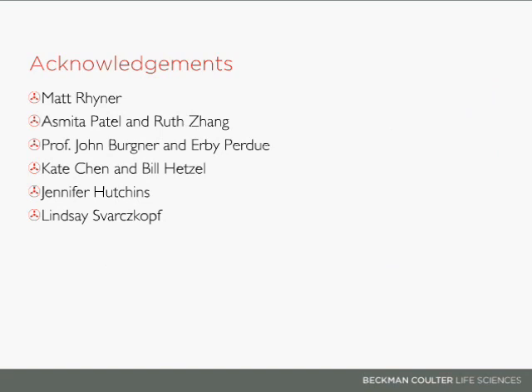So I've had a chance to run through the survey. At this point, I'll address several of the questions that were asked. First one here is, how can I know the shape of the nanoparticles by AUC? This comes out actually from the fitting in one of the third-party software programs, SedFit, UltraScan. They determine the frictional ratio, or that frictional drag that particles experience while sedimenting.